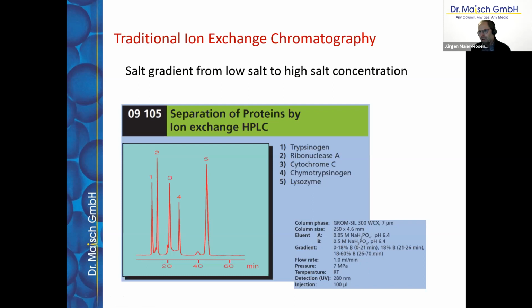Increasing the buffer concentration will lead to the elution, in this case, of the proteins, the cations. So that's how it's typically used.